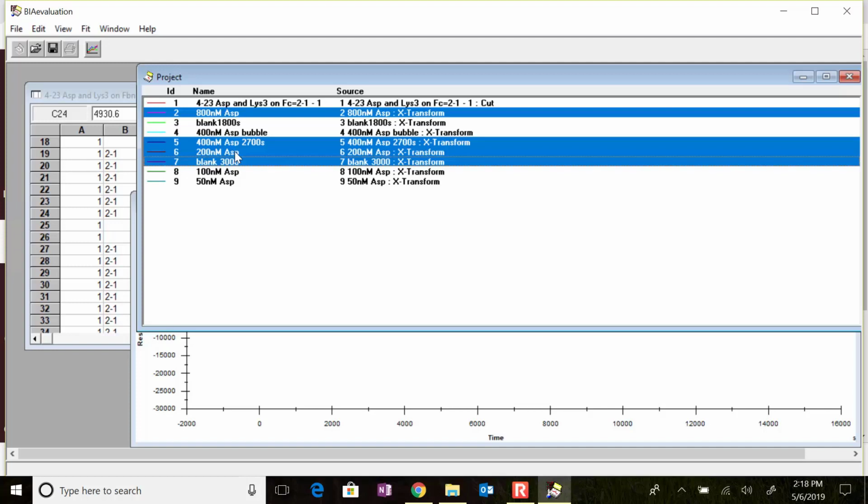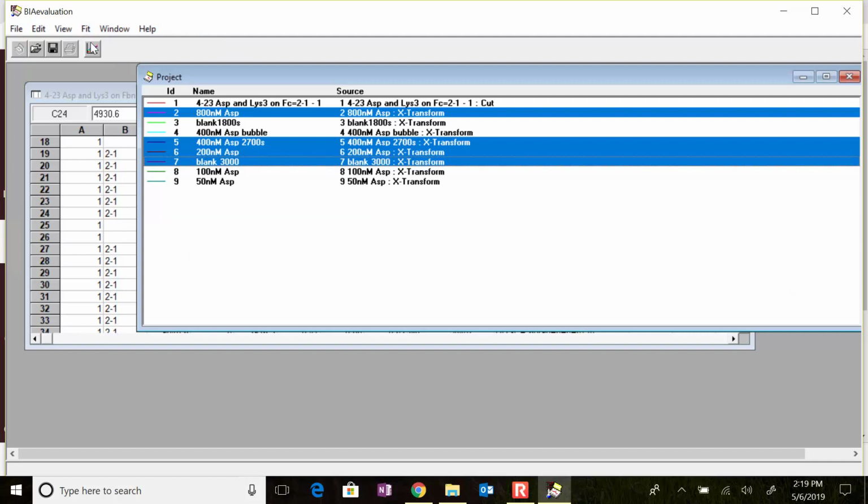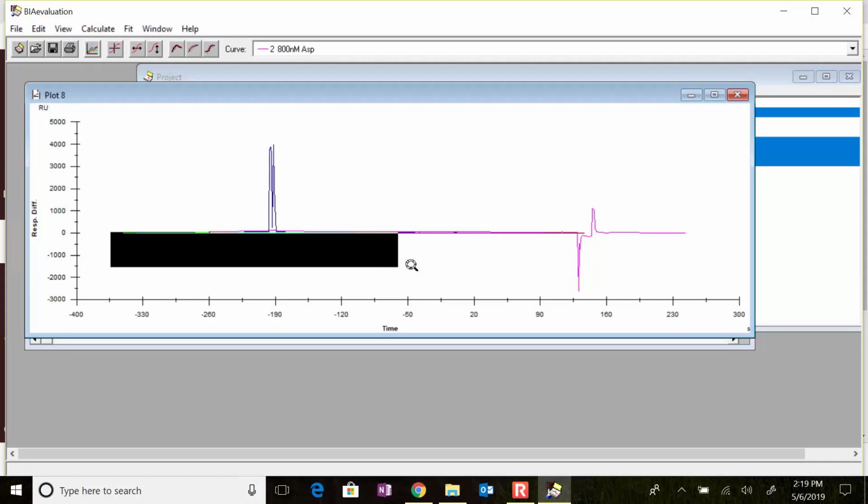These are actually lower concentrations than most of our other samples, you'll notice. So you'll probably be able to get more than 3 from your own. Okay. Oh, and I'm going to go ahead and close this so it doesn't get confused. All right. So I've shift selected those 4 that I want, and now I've put it into here.